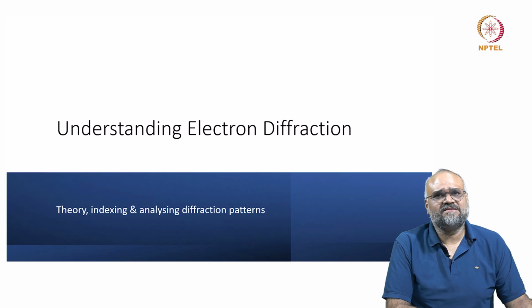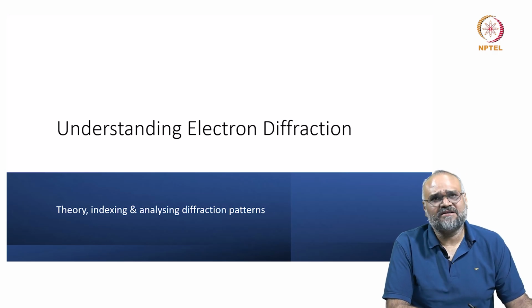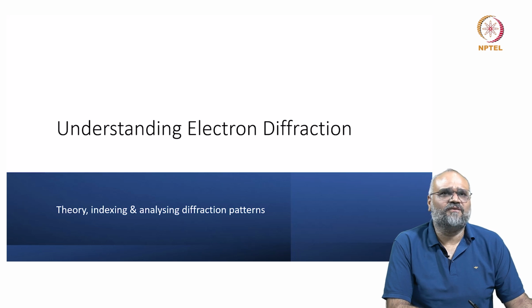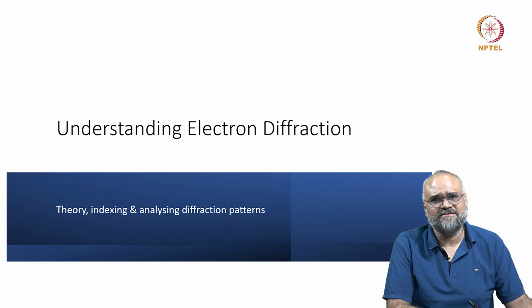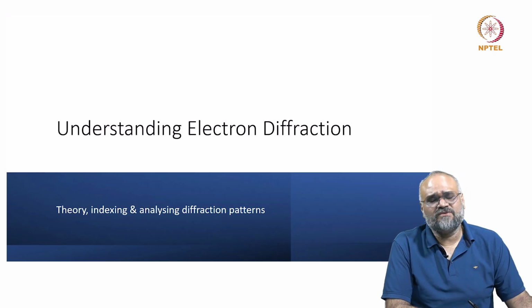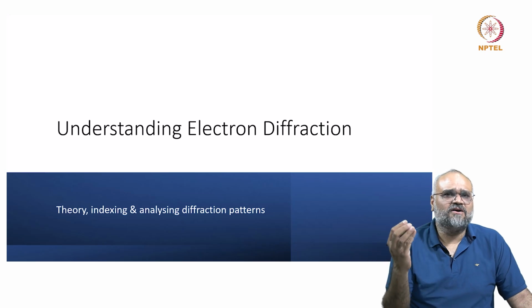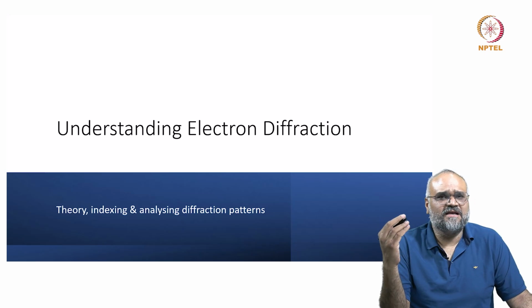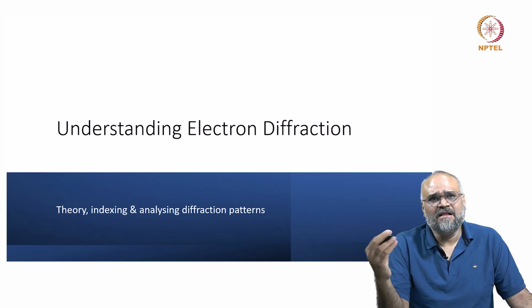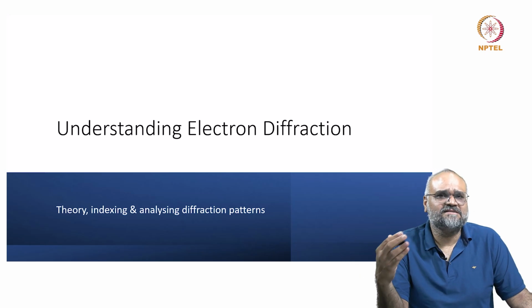Let us see what these diffraction patterns look like, what are the similarities and differences from X-ray diffraction, what is the origin of the signals that you get in a diffraction pattern, and how do you analyze them and index them in the next lectures. I'll first show you how the diffraction patterns are obtained, and we'll discuss a little bit on how to get them really at the TEM by showing some experimental demonstration sessions. And while we analyze the data that is obtained, we'll understand indexing of the diffraction patterns.